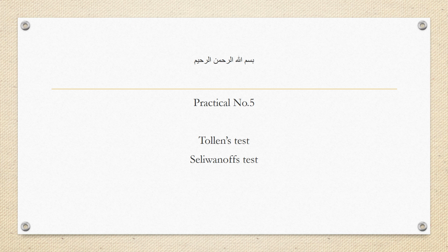In today's lesson, we will talk about two tests, which are Tollen's test and Seliwanoff's test. Both of them are detecting some carbohydrates, as we will see.